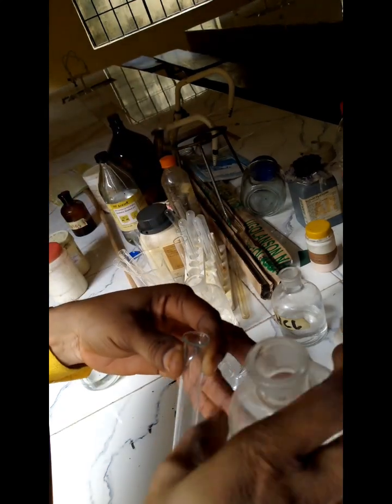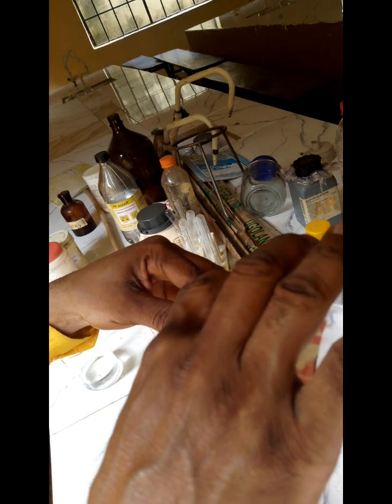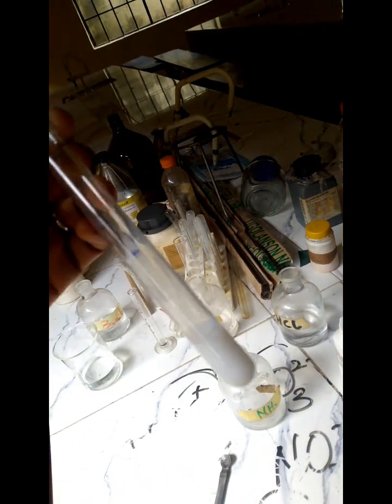We see a clear colorless solution. On doing that, we should have a white precipitate. Let's add barium chloride to it. Good. Look at it. There's a white precipitate. We are having a white precipitate here with this barium chloride. Hope you can see it clearly. Yeah, you see, it's white. Yes, white precipitate with the barium chloride.